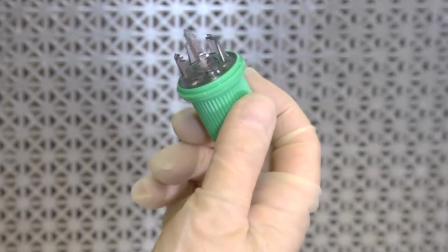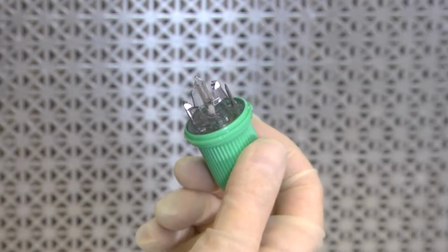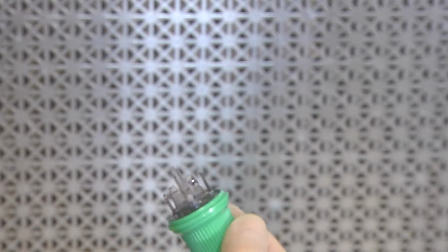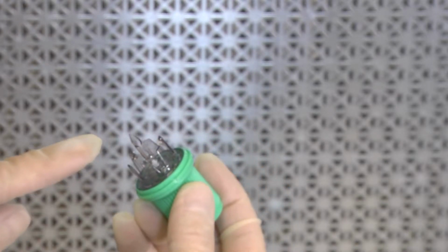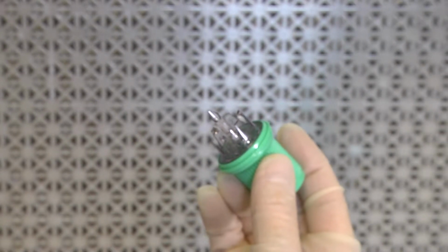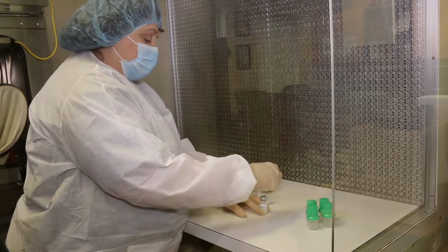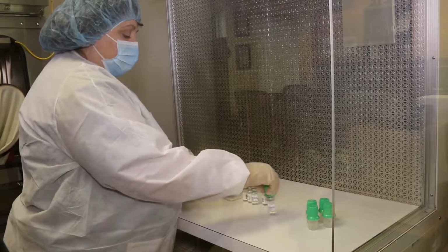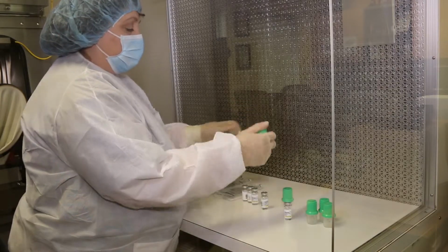If I did it this way, it would maybe core the top of that vial while placing this mechanism onto the vial. So you always want to make sure that the opening of this needle, the eye of this needle, is facing your eye. And then slowly, as it's facing it, go straight in and attach. And go to the next one without shadowing.